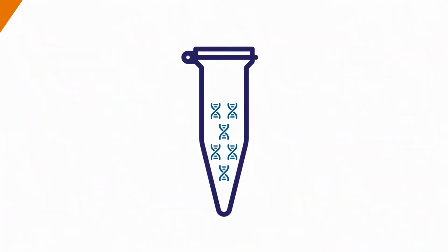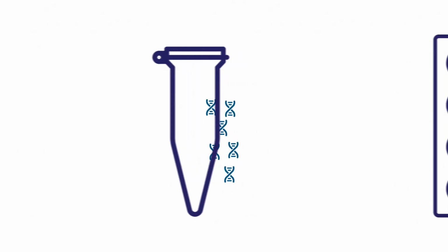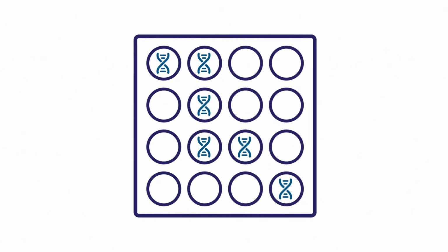Whew, making all those standards was a bit of work. Is there any other way to get this type of data without the need for standards? Why, yes. There is one other way to get absolute quantities with Taq assays, and that is to use digital PCR. Digital PCR works by partitioning a dilute, approximately single copy sample into many individual real-time PCR reactions.